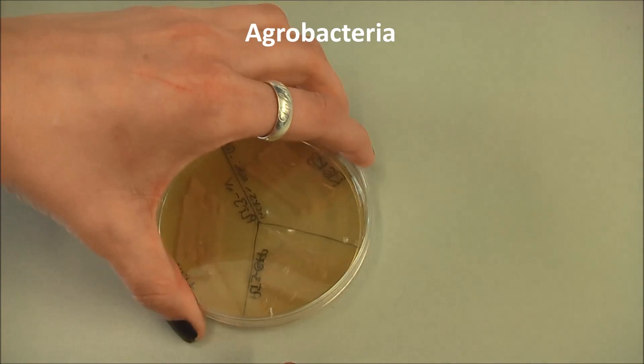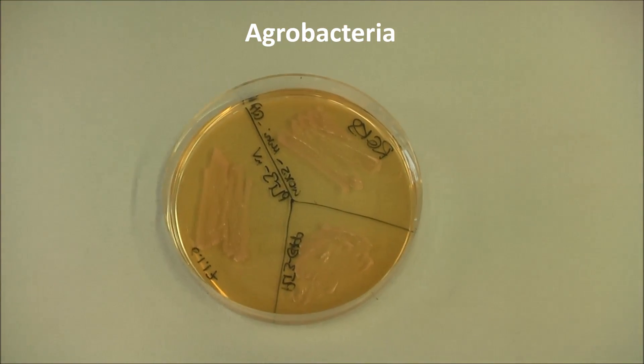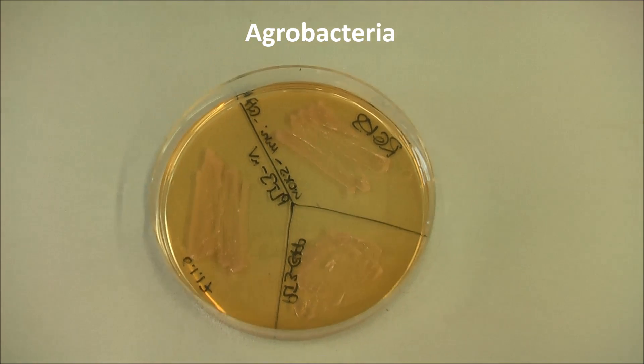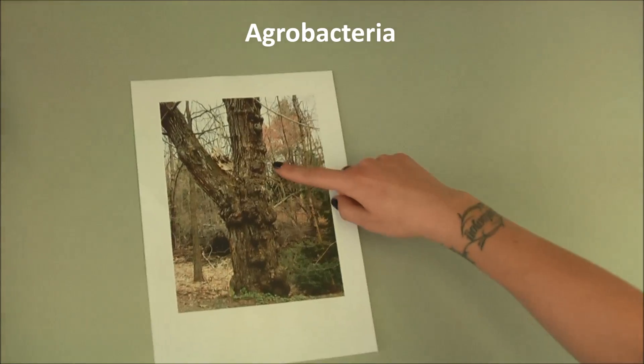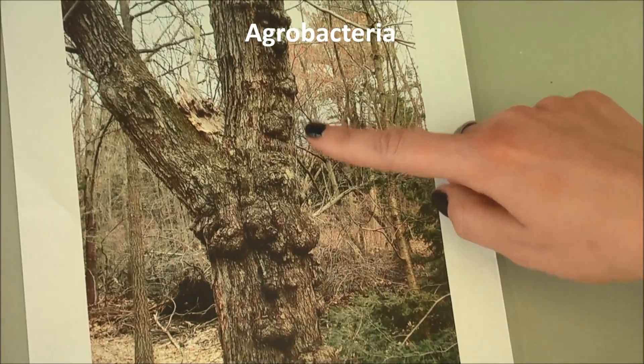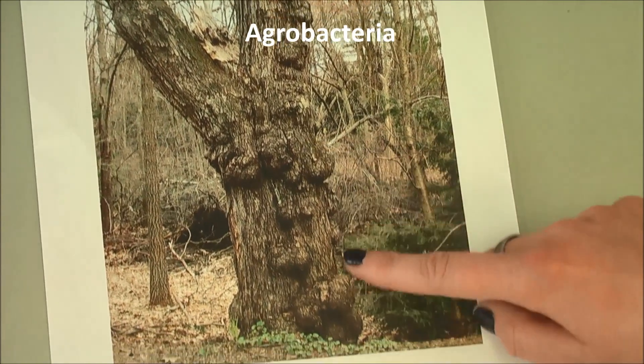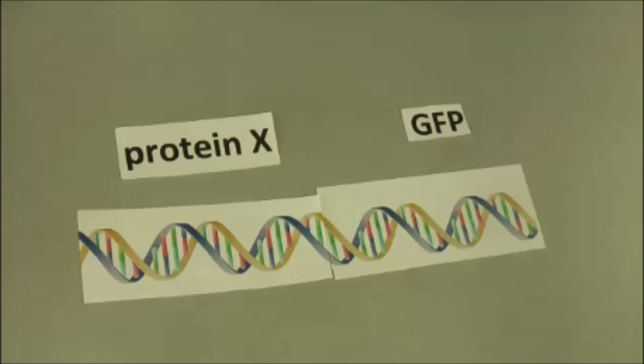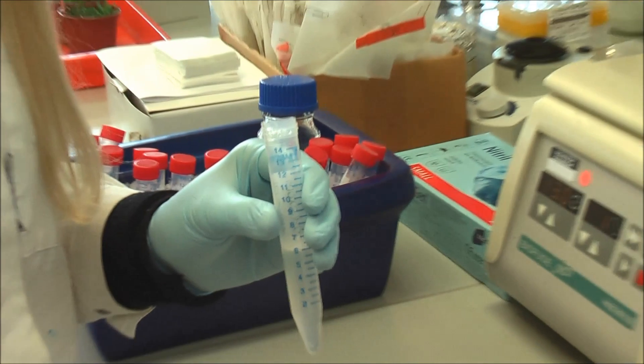To integrate the DNA into a plant, we use agrobacteria. In nature, they live in the soil, enter plant tissue and integrate a part of their own DNA into the plant's DNA. The plant forms galls in which the bacteria can spread. When we integrate the DNA of interest into the agrobacteria, we can use them to transfer this DNA to the plants.